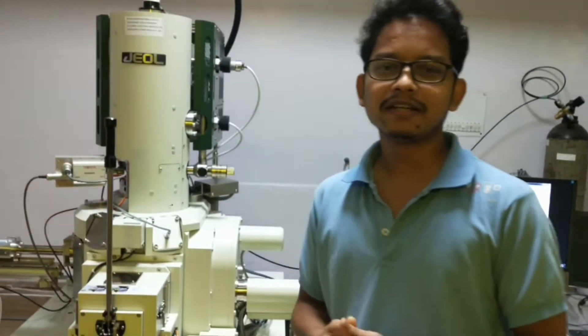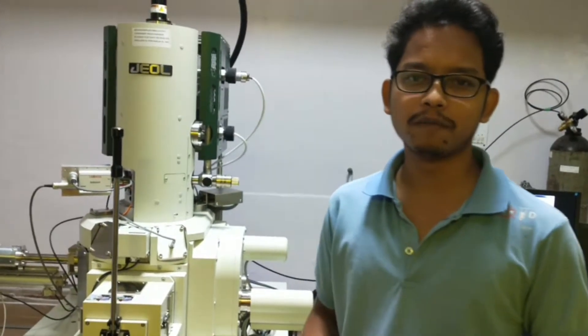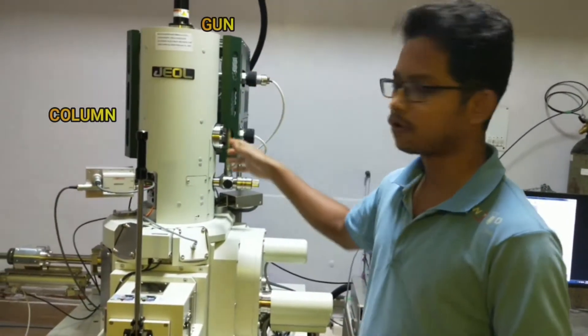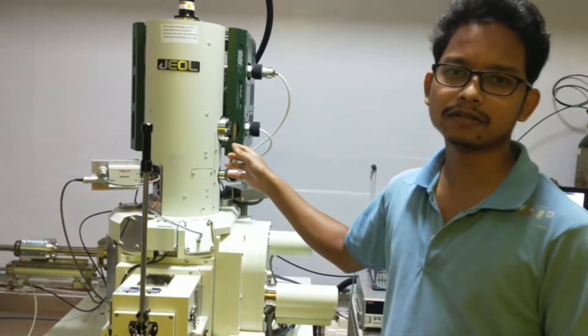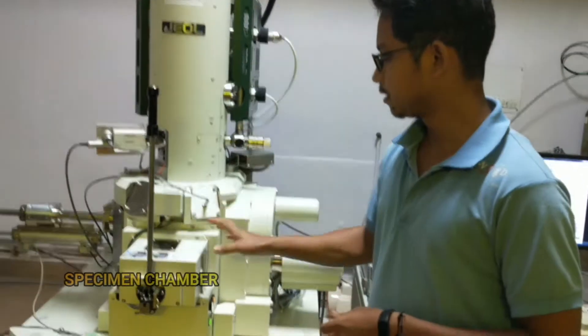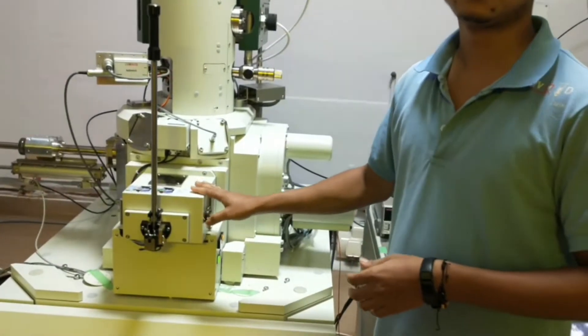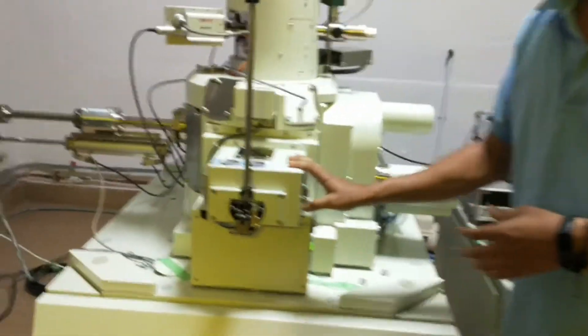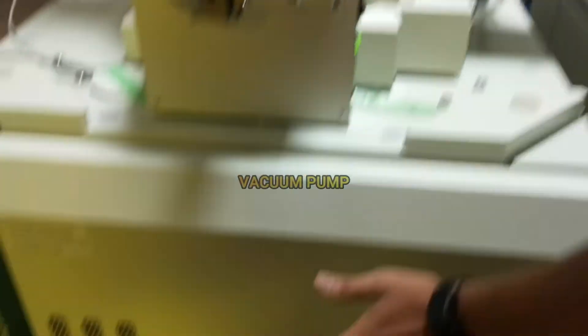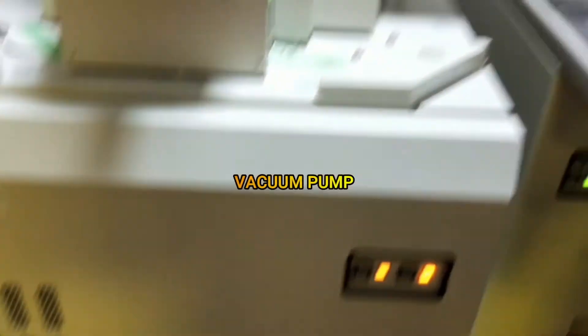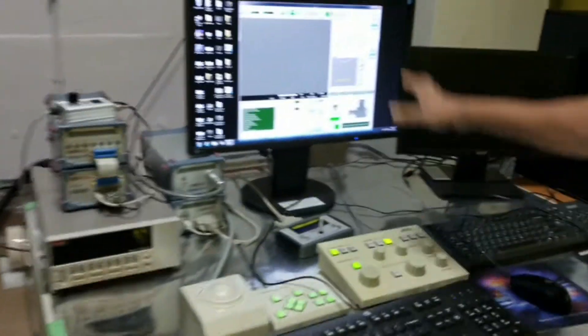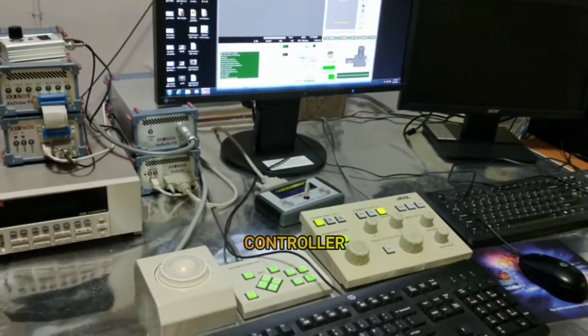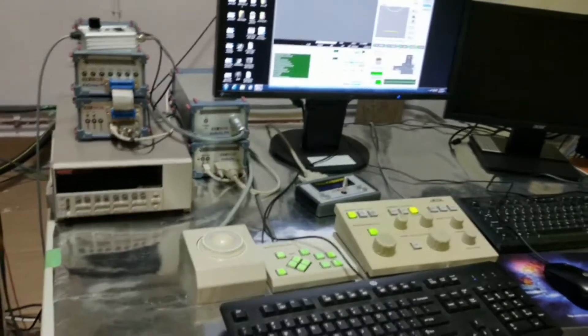There are certain main components here like this column where the electrons are generated, then the specimen chamber where we can keep our sample inside, then the vacuum pump, then the monitor and the controller. These are the main components.